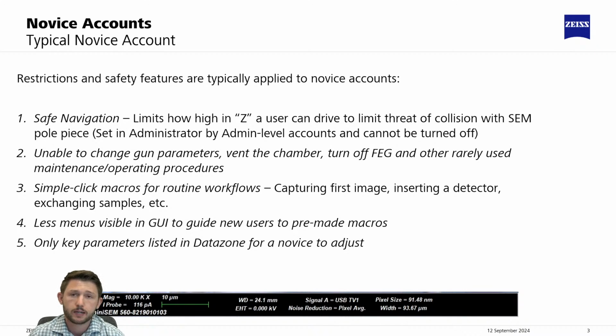The second point is that they're unable to change a lot of the deeper level settings that perhaps an expert user might play with on certain occasions. Certain gun parameters, being able to vent the chamber, turning off the field emission gun, and some of the other rarely used operating or maintenance conditions would not be accessible by these novice accounts.